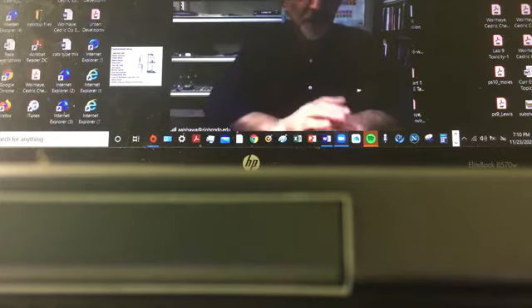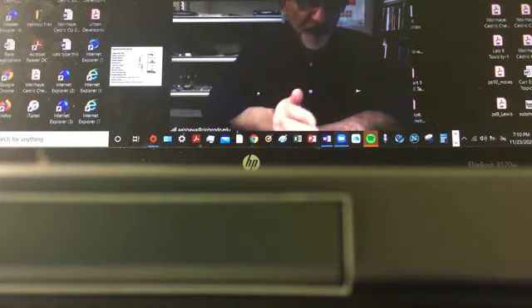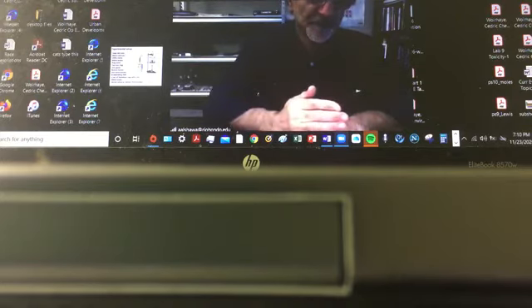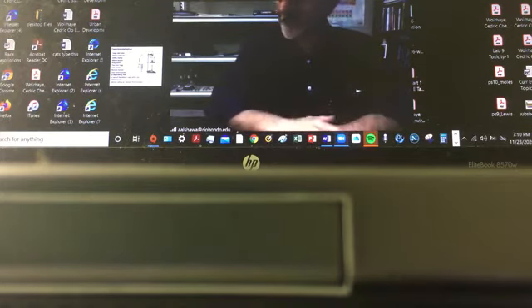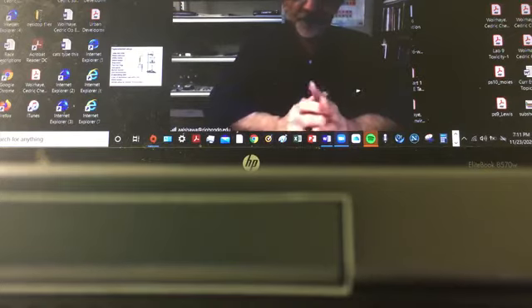So the reason we're going to do that final measurement, the final temperature, is by what's known as extrapolation. I'll show you in a second how to do it using software. Tonight we're going to be using software to measure the final temperature by the process of extrapolation.